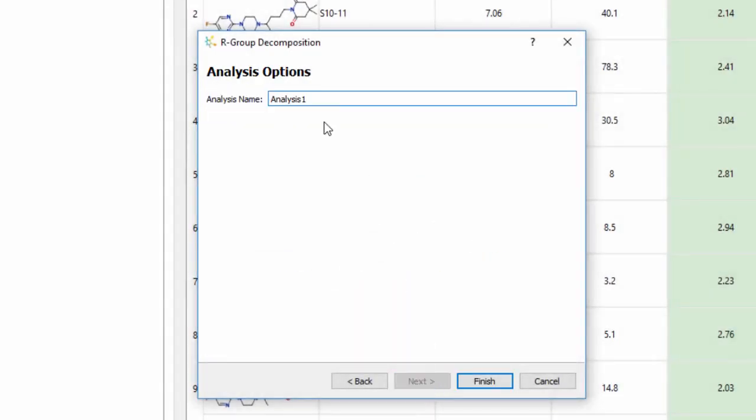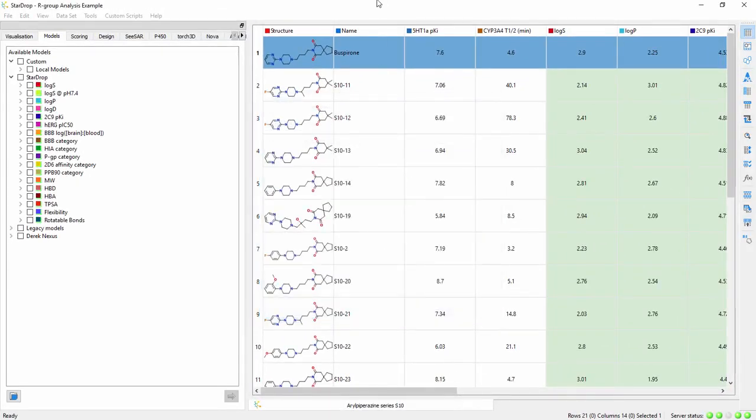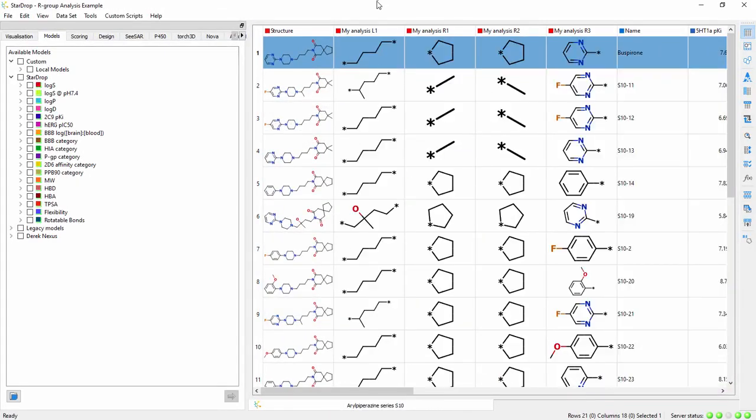If you click Next, you can give your analysis a name for convenience. Click Finish to perform the analysis.